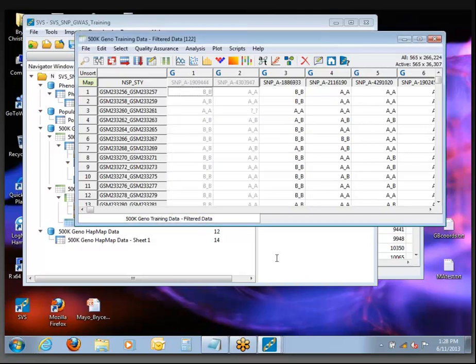The way to test it would be to rerun at 0.5 and see if we end up with more or fewer SNPs. With 10%, that means anything at 90% relationship is filtered out; if it's at 50%, it's out; if it's even at 11%, they are too closely related. So anything that's left is going to be very close to zero — they're not related to each other.